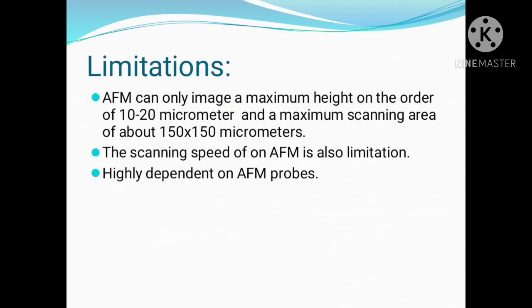The last is the limitations. AFM can only image a maximum height on the order of 10 to 20 micrometers and a maximum scanning area of about 150 by 150 micrometers. The scanning speed of an AFM is also a limitation and is highly dependent on the AFM probes.